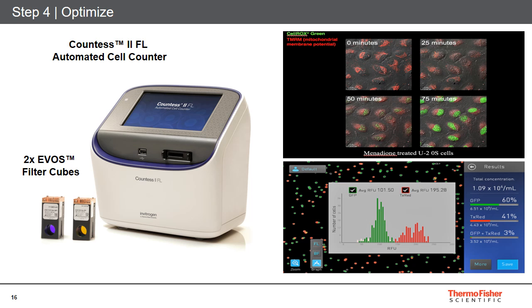And so on the bottom, we see a representative image of one of those data points where we see that we're at this transition between the Texas Red TMRM signal going down and the GFP positive CellROX Green signal coming on. So it's really just another tool that one should consider when starting to set up a new set of experiments. This can be rather powerful and quite valuable in terms of time savings.